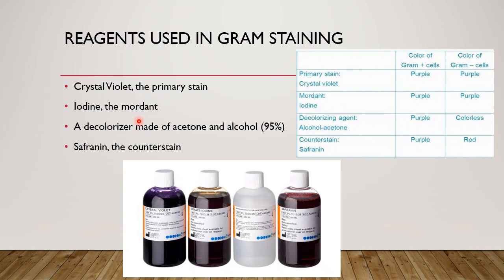That means it acts as a link between the dye and the target material onto which you want to stain. It forms a complex that fixes the dye in place. So what happens by doing so? The mordant enhances the dye's ability to adhere and intensifies the stain. It leads to more stable and vibrant colors that are less likely to wash away or fade. That is the function of a mordant.